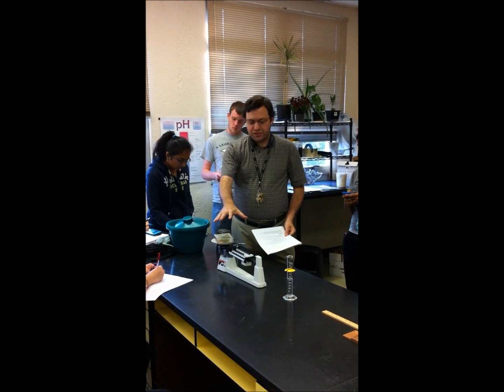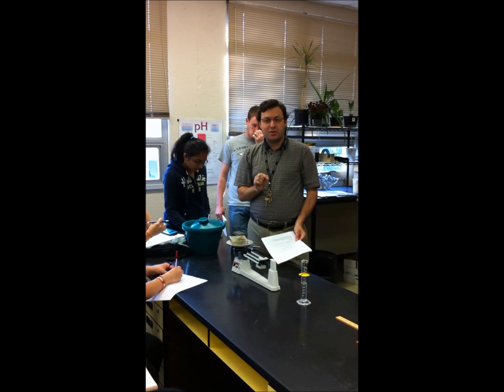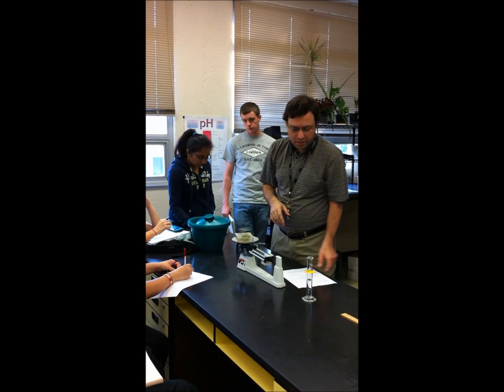Okay, triple beam balance is always measured in grams, and this can measure down to 1/10 of a gram. Okay, so that's as far down as you have to go.